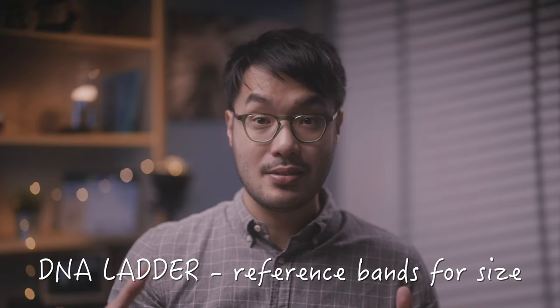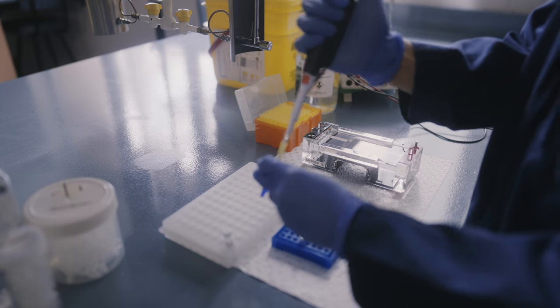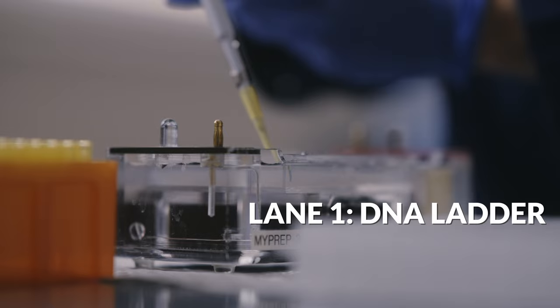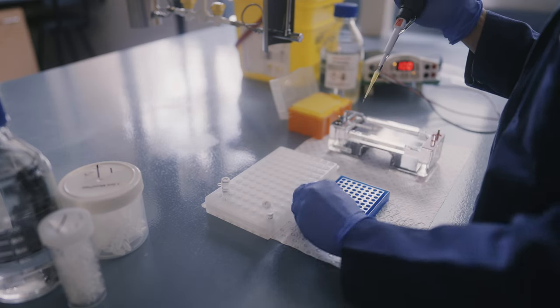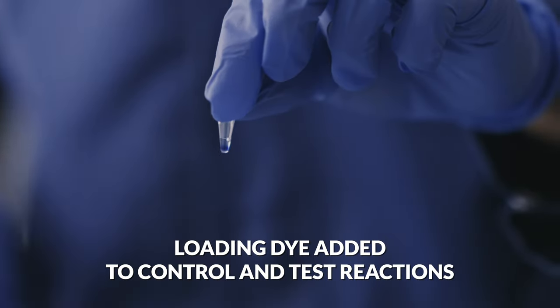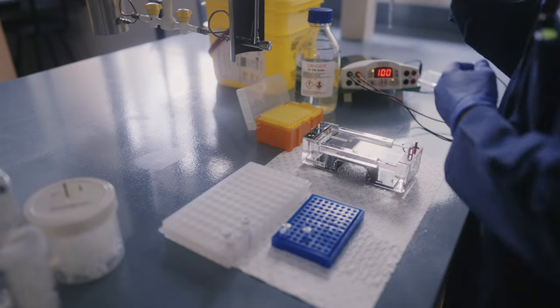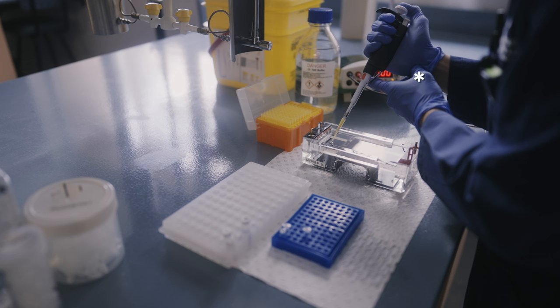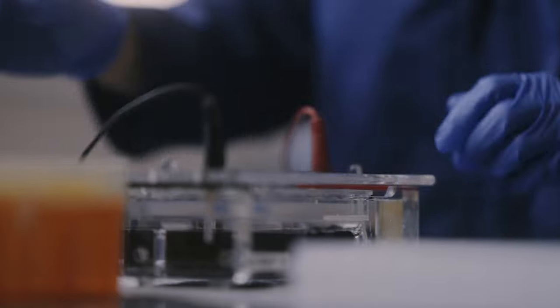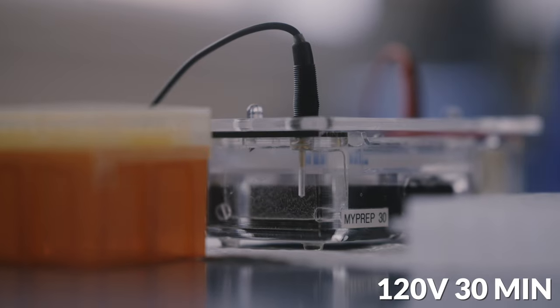Once your PCR reaction has finished running, we load the samples onto the gel. We need a DNA ladder — a reference set of DNA bands of known size to compare against the bands in our PCR reactions. DNA ladders are commercially available and already contain a loading dye, the dark bluish-purple dye that we can see as the DNA samples migrate further down the gel. Our PCR reactions are still completely see-through at this point, so we need to add a loading dye separately to our own reaction samples. We then load the control and test reaction samples in separate lanes, inserting the tip of the pipette into the top of the lane, taking care not to pipette bubbles into the gel. Some scientists use their off-hand to support the pipette and make sure each sample only goes into one lane. Now let's attach the anode and cathode onto the tank and start the electrophoresis reaction. Common settings are 120 volts for 30 minutes, but you can adjust this as you go.